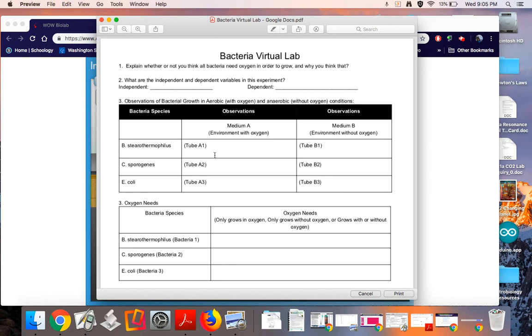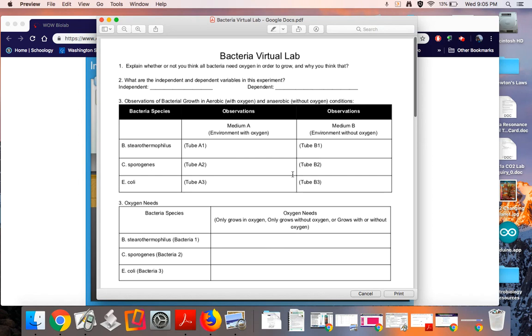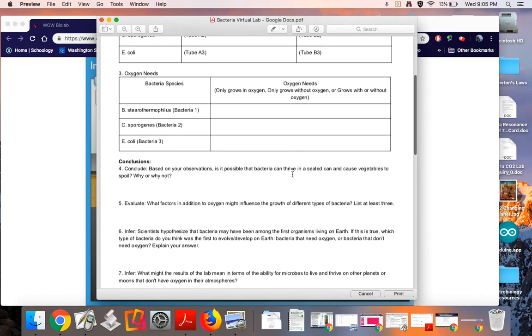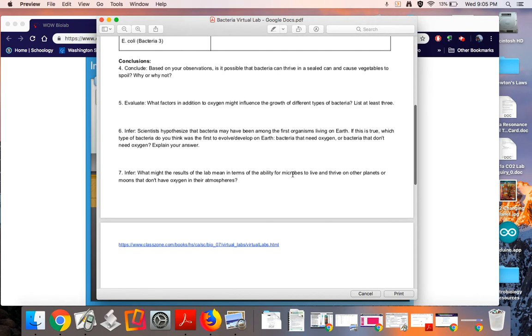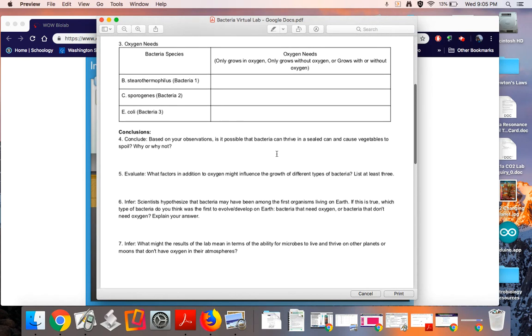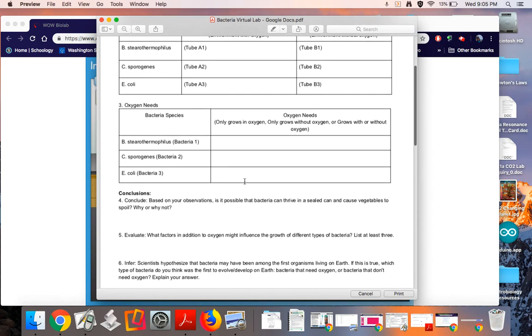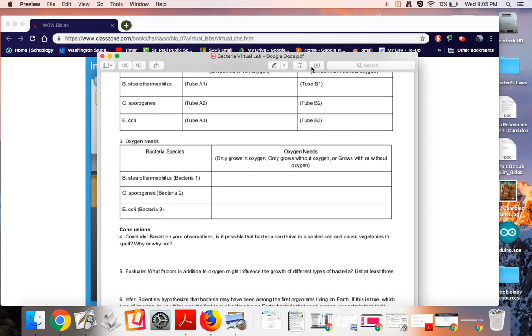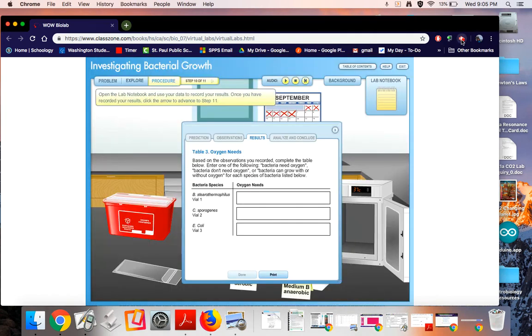Or does it grow in both environments, so it grows in both A and B? And record your results here. When you're done with that, there are a few questions that I would like you to answer to think about this result. So the video is now over and you can finish completing your lab notebook page.